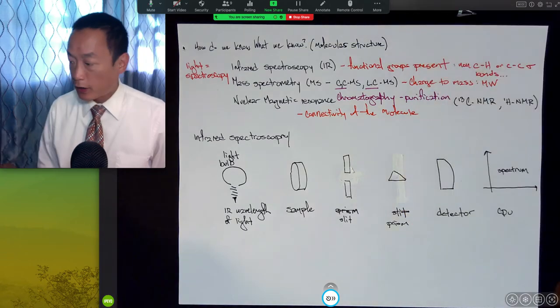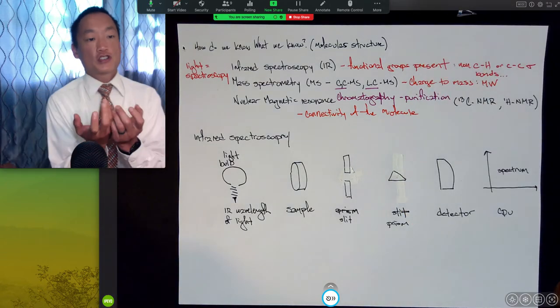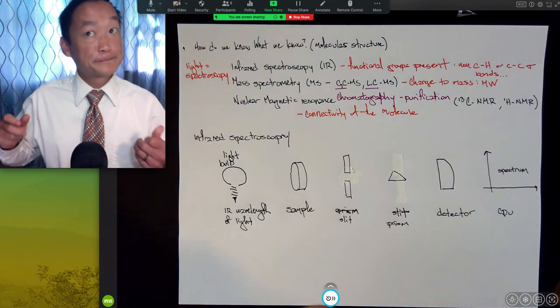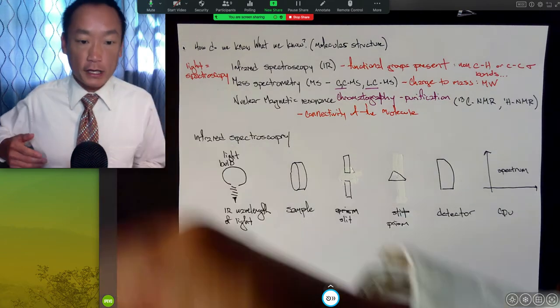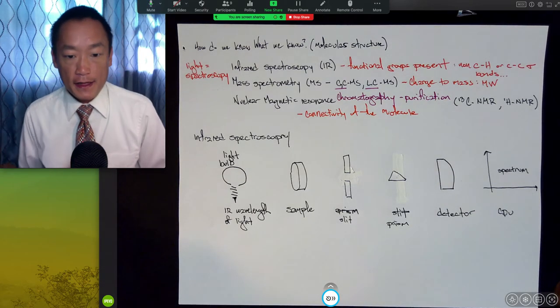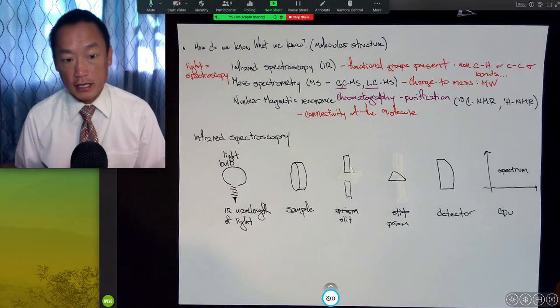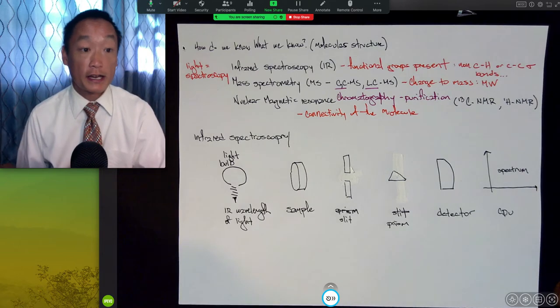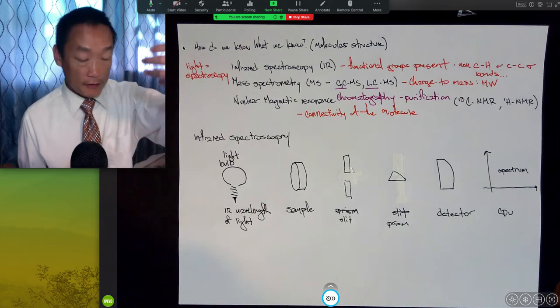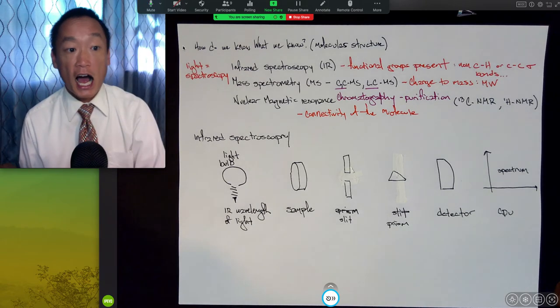Oh, this is so fun. Okay, so let's envision that we're going to use the visible spectrum of light to represent the different wavelengths of light that could be generated with this IR light. But understand, unless you're like a gecko or something, we can't visually see the IR spectrum of light.